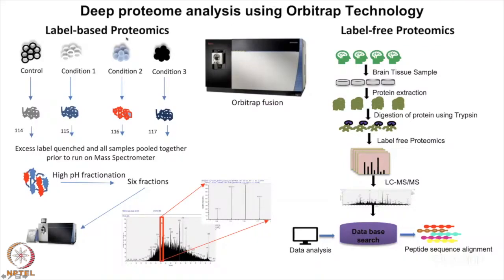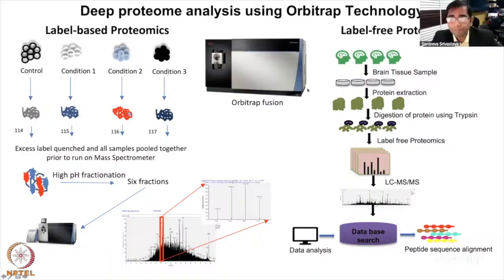So we can try to take the sample and proceed for the mass spec analysis. So TS will now take the peptide and will go shortly to one of the instruments which we have, which is a high throughput proteomics instrument for doing the deep proteome analysis. Most of the time, your goal is first to look at how many proteins we can get from that sample, right? So in that way, you are now going to do the deep proteome analysis.